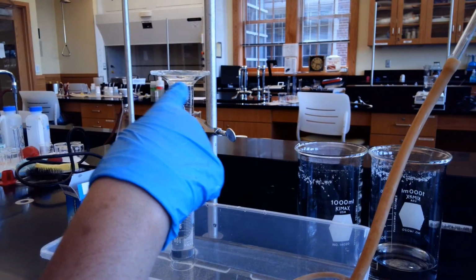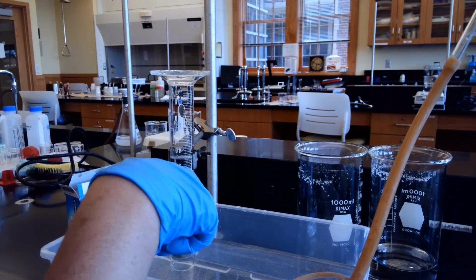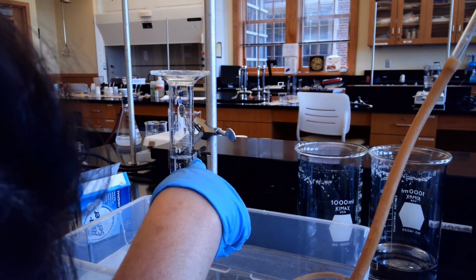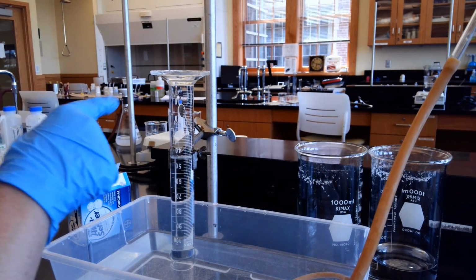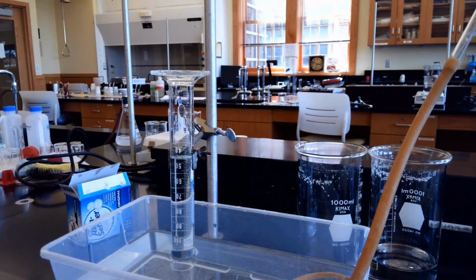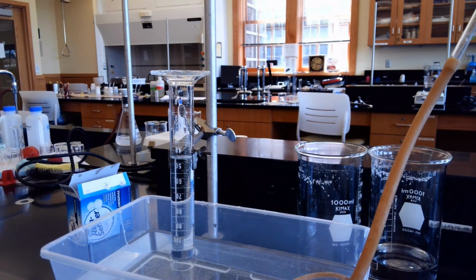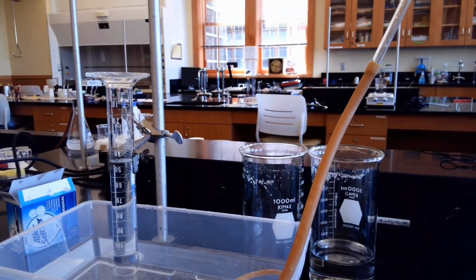So if we're looking at the meniscus, remember we're not going to read from the top, we're going to read from the bottom still of where it pushed it. So we are sitting right at 48 milliliters. So we evolved 48 milliliters of CO2. So now that this is at 48 milliliters, the last thing we have to do is just remass our gas generator. So I'm going to swing you back this way.